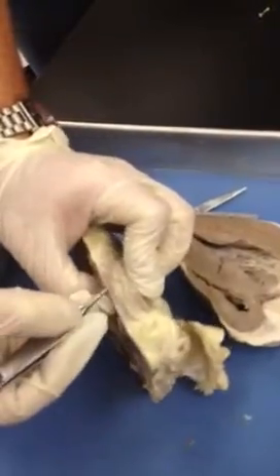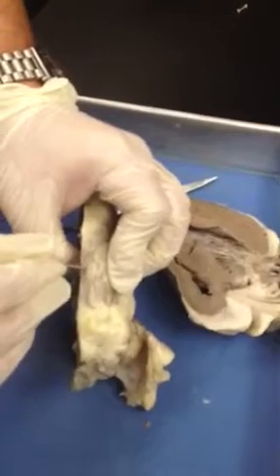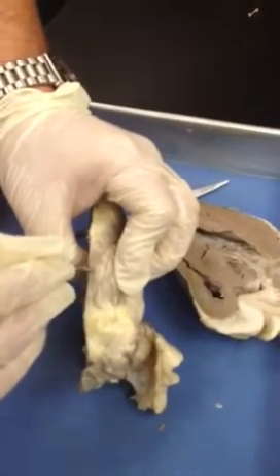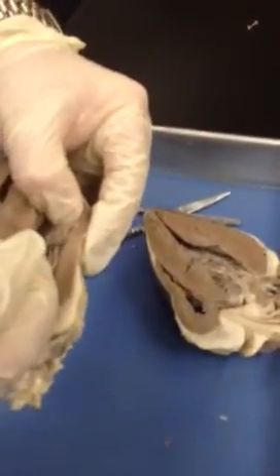This layer on the outside of the heart is going to be called the epicardium, which is our serous membrane on the outside of the heart — we can also call this the visceral pericardium. The lining on the inside is going to be called the endocardium, and the heart muscle itself is called the myocardium.